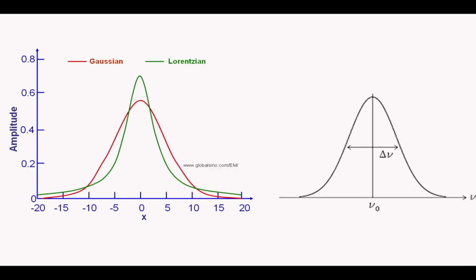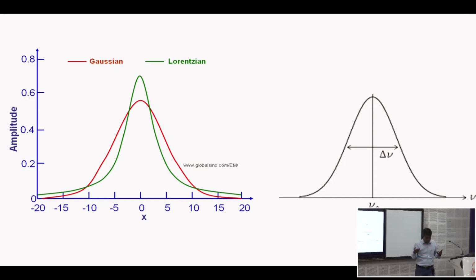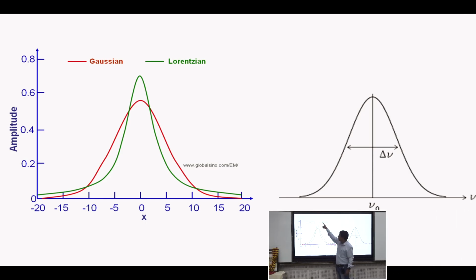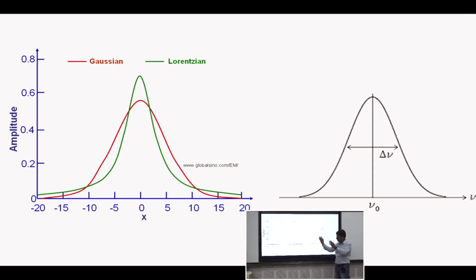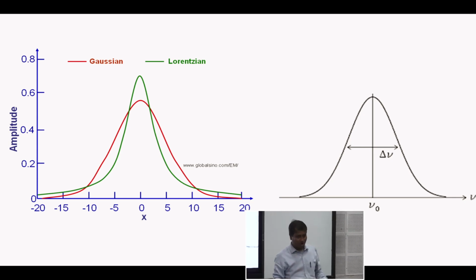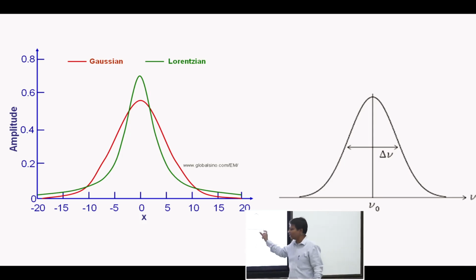So this is, say, a spectrum. This is a spectrum. This is a band. This is a line, depending on where you are using it. There are usually two shapes, and three are also possible, usually Gaussian and Lorentzian. This red one is Gaussian, and the green one is Lorentzian. So we are expecting this kind of spectrum or band. Sometimes the spectrum or band comes very weak, sometimes strong, sometimes the width is quite big, sometimes it's narrow.